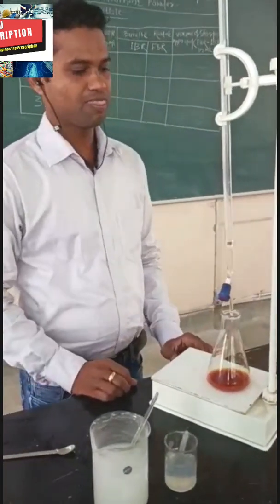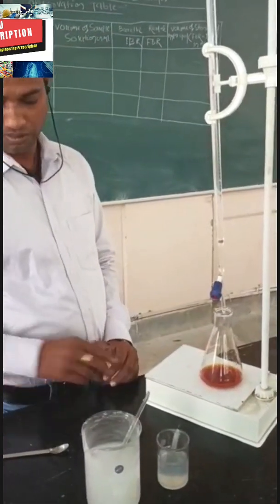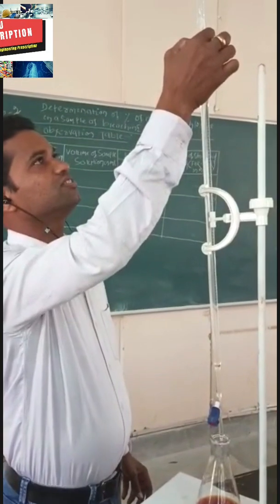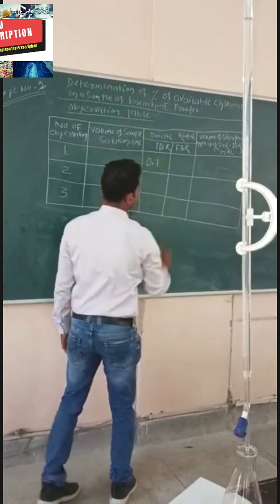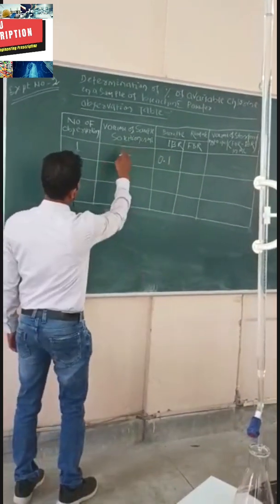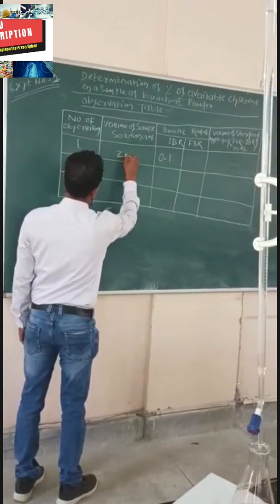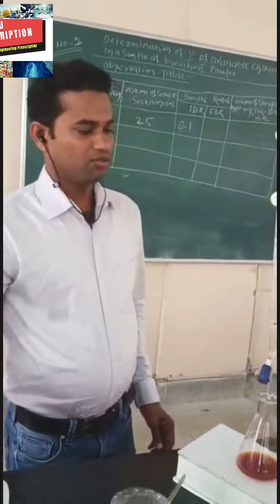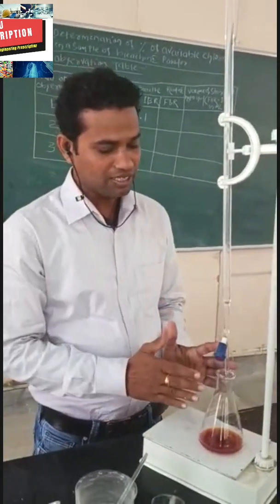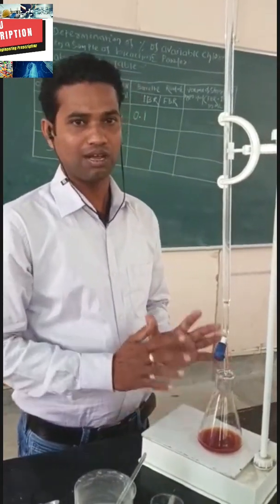Now we start titration. Before adding hypo solution from the burette, first we note the initial burette reading — it is 0.1. The initial reading is 0.1. The volume of sample solution pipetted out is 25 ml. Now we add hypo solution until pale yellow color appears.